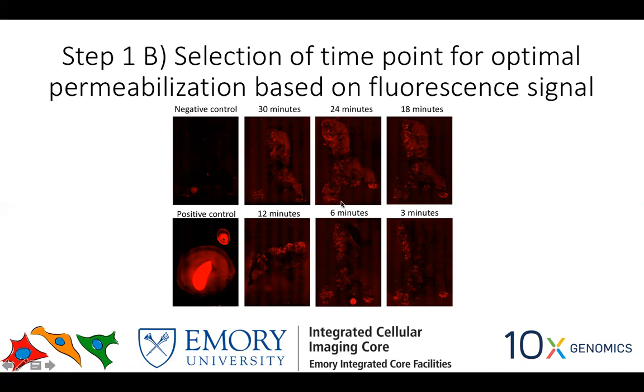Probably if you had talked to Fred or somebody, they would have told you that you need to determine the tissue permeabilization time, and the tissue permeabilization time varies between tissues. Lungs will be different than liver, brain, heart, and so on. So every tissue will have a different permeabilization time. And for you, it's going to matter a lot since things are getting shipped from Texas. So that is another variability that you need to consider.